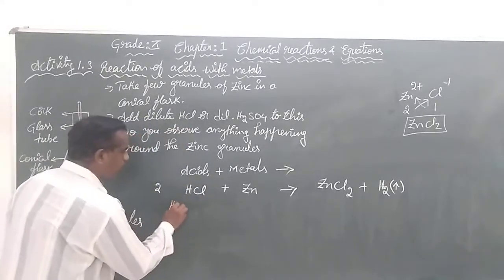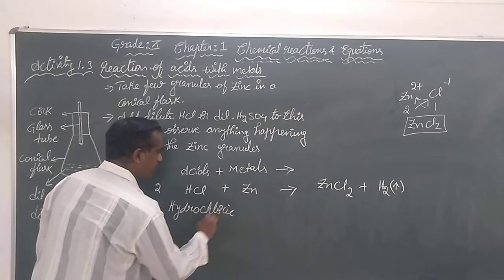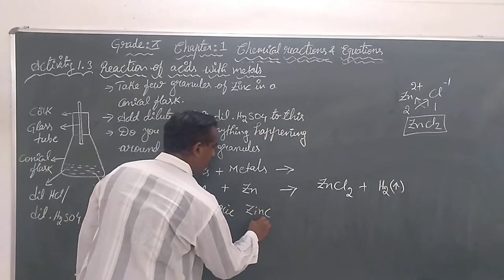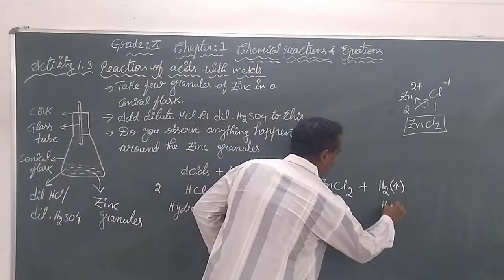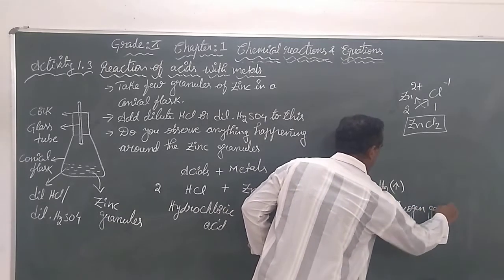So hydrochloric acid reacts with zinc granules to release hydrogen gas.